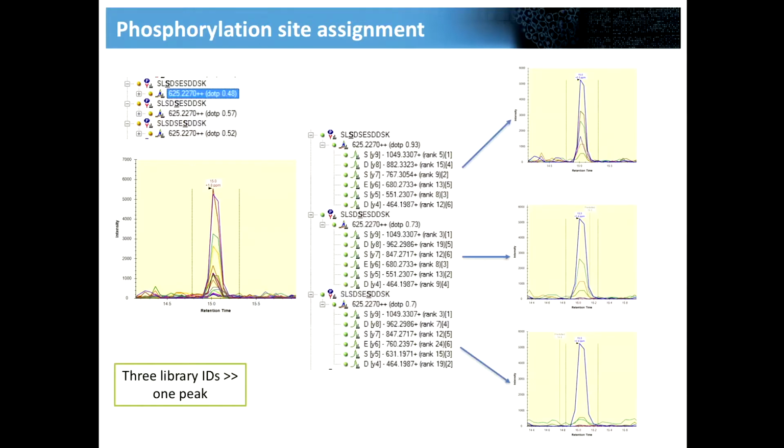This was an example with two, and of course, as you've seen already in phospho data, you don't always have two localizations, and so far I've only shown you examples with one phosphorylation site. So let's take an example with three. Again, deciding on which is the correct ion to resolve these three possible localizations is going to be more difficult.